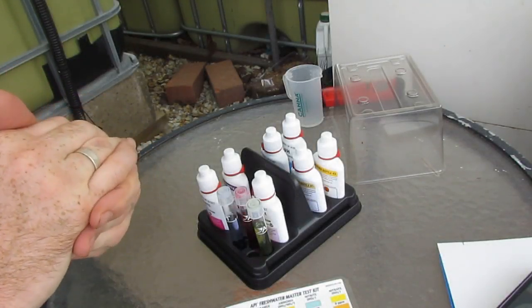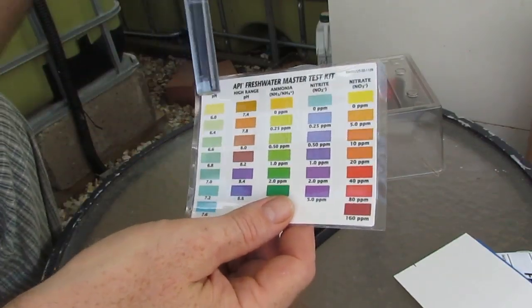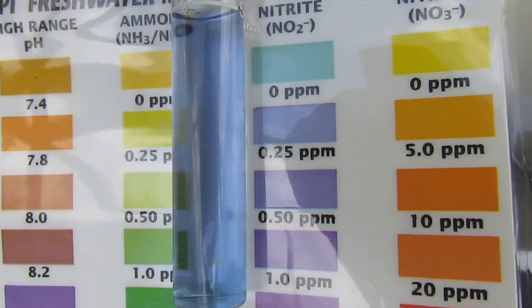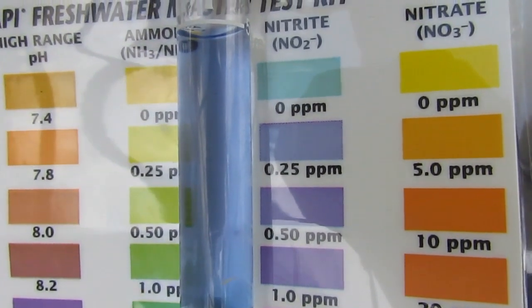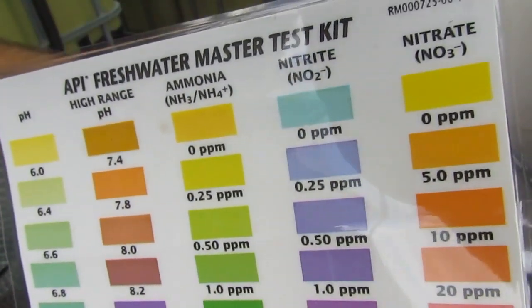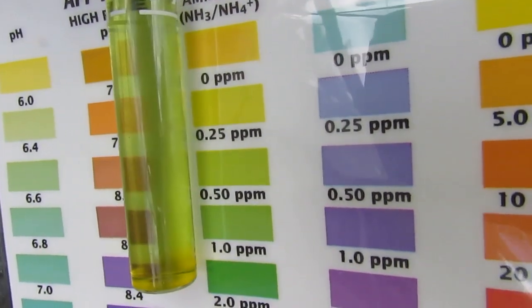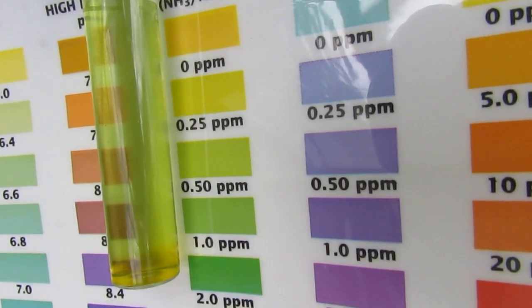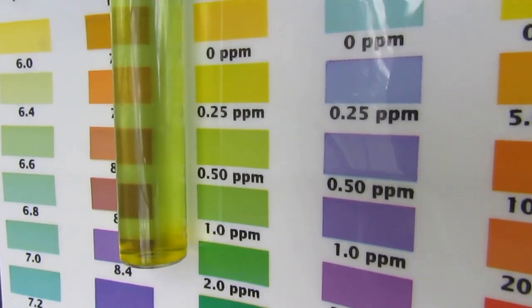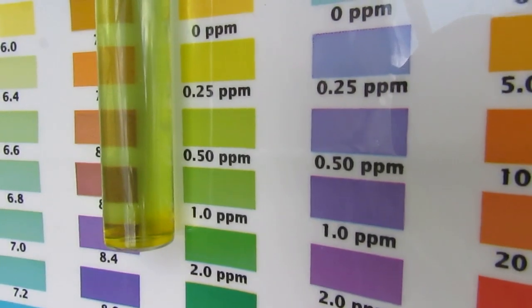The timer is about to go off any second now and we'll have a quick look. We'll start with the nitrite. The nitrite I think is around about 0.25 parts per million there. Normally it's around about zero, or just a trace, so it has risen a little bit. Now the ammonia looks to be around about 0.25 to 0.5 parts per million — probably closer to 0.5 parts per million. So that's starting to climb up a little bit as well.